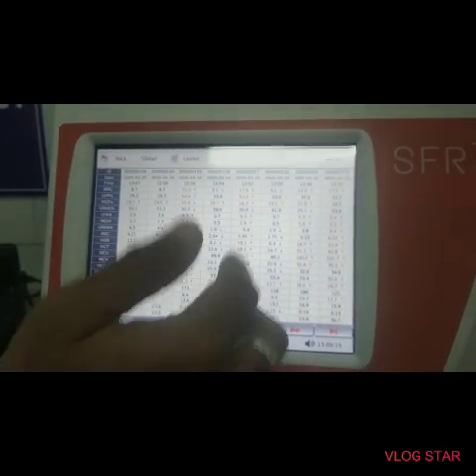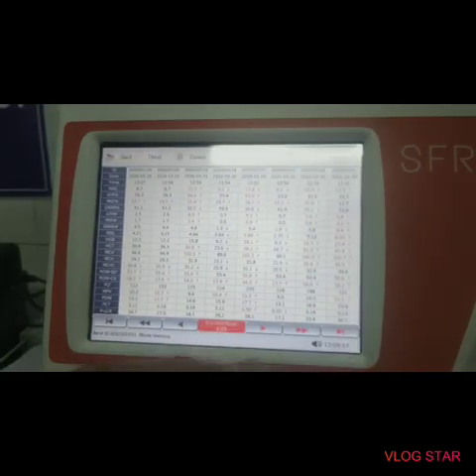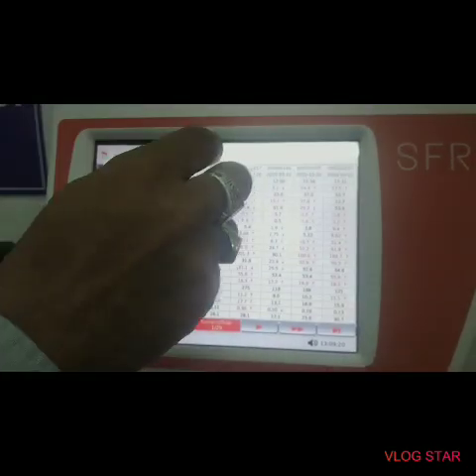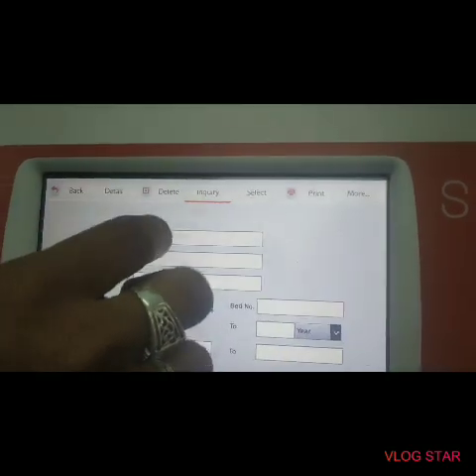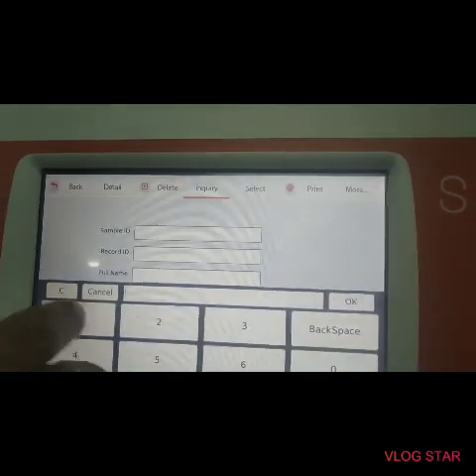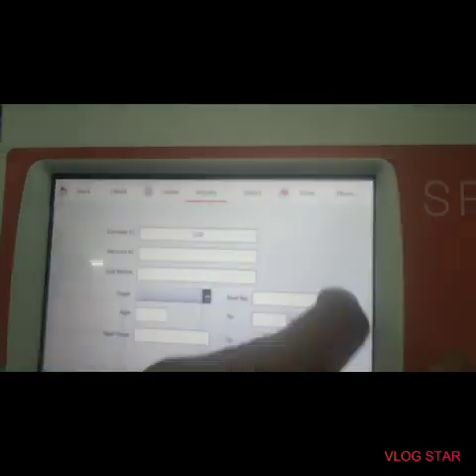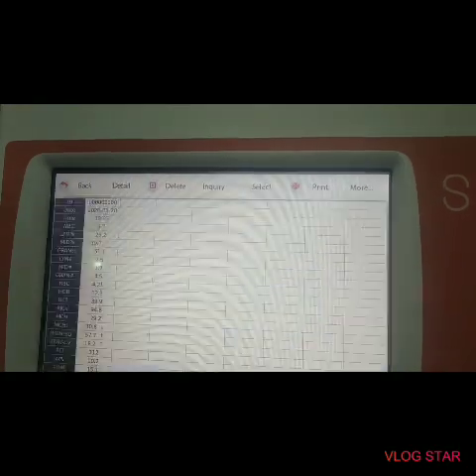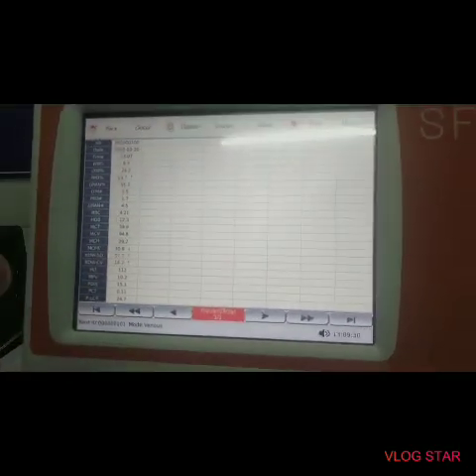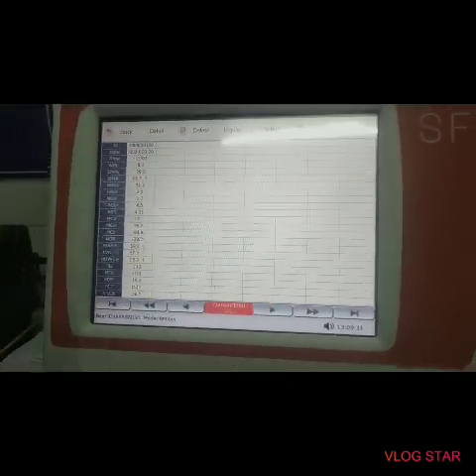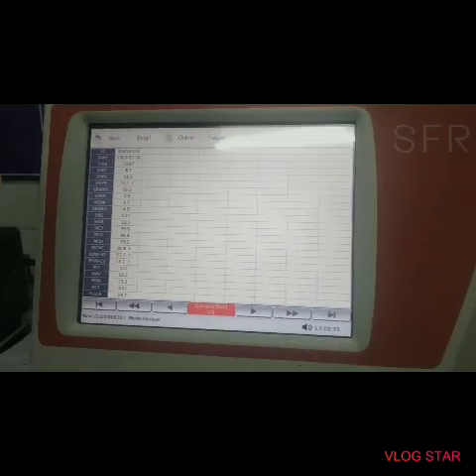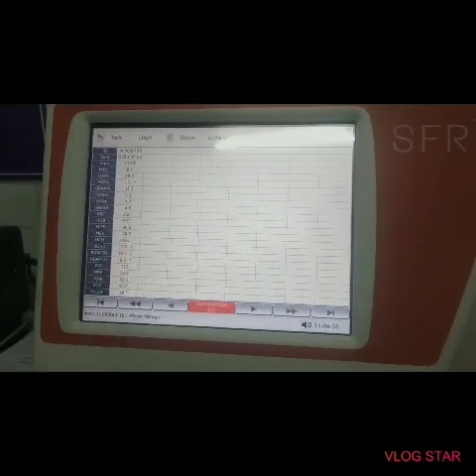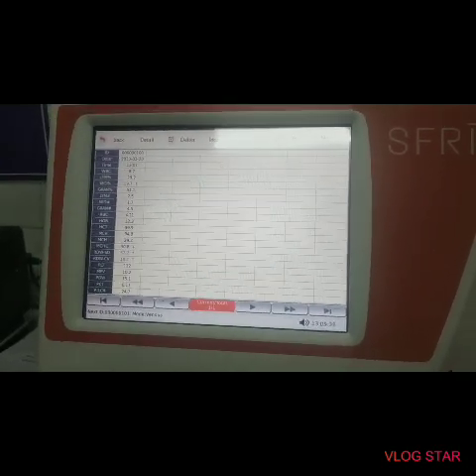We will also see the ID. We will have 4 days as we have found the ID. In the Inquiry section, we have sample ID, so we have 100. Confirm. We have set up the fixed ID setup.